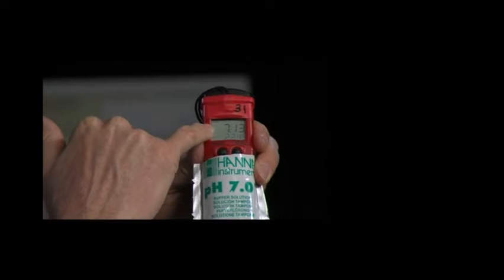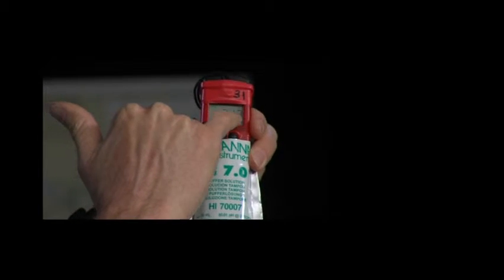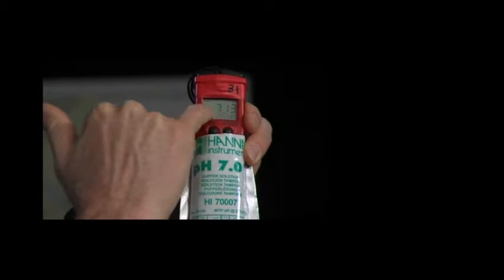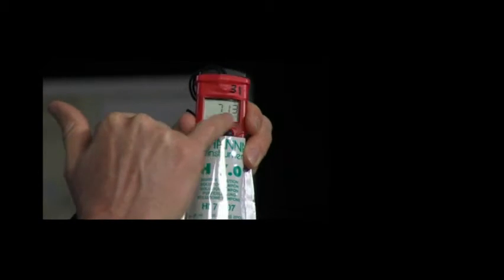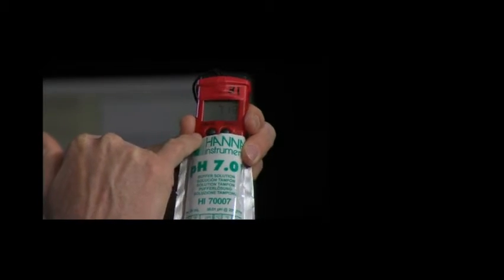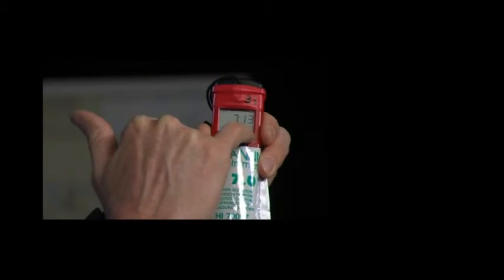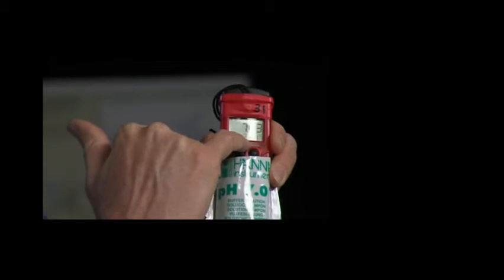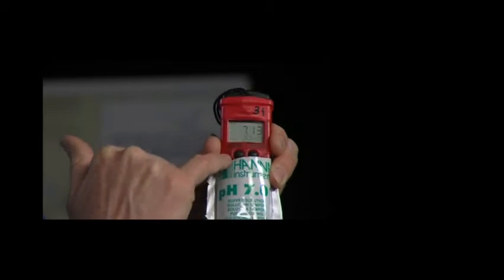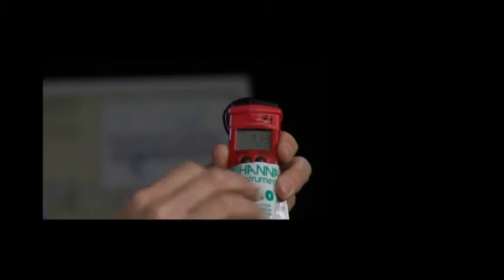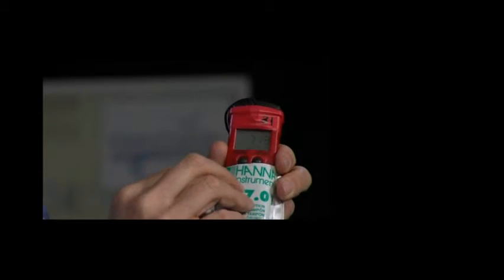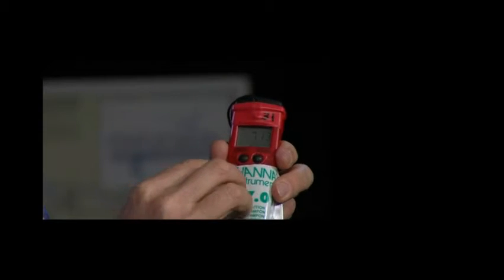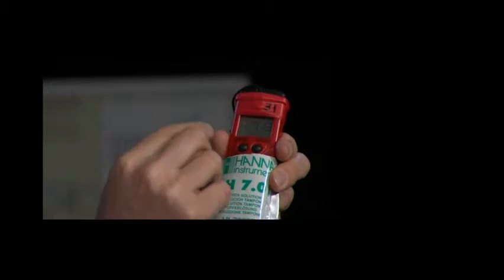Then it will start to give you a number up here that is a pH number. Underneath it is the temperature of the water or the temperature of the sample in here. We're not too concerned with the temperature of the sample right now. We're just going to calibrate it.